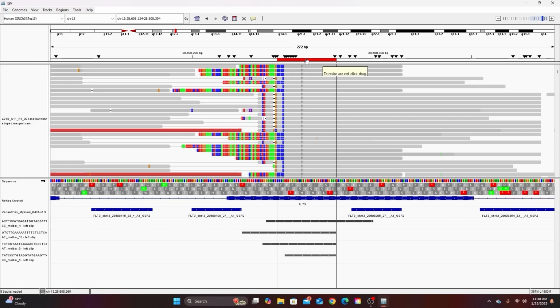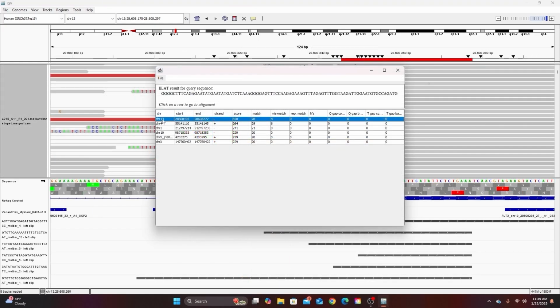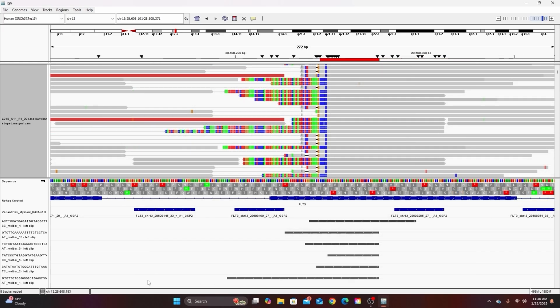Now, the one I entered up here is the smaller of the two structural variants that are found in this location. Now, sometimes a structural variant will align to places on multiple different chromosomes. It's probably wise to select the match that has the highest score. All right, now obviously things start to get kind of crowded and this is all redundant information.